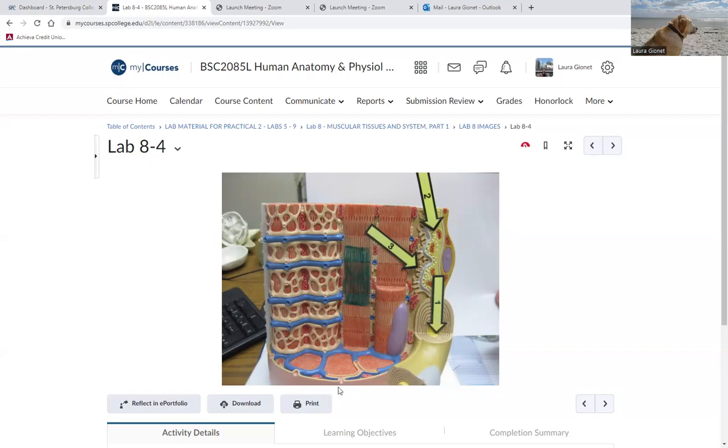Now, if I look to the bottom here, you have kind of a pink membranous region. That is the sarcolemma. The sarcolemma is just a fancy word for the plasma membrane of a muscle cell or fiber, and it's in this medium pink color here. It surrounds the whole thing, but that's where we see it down here. While we're here, I'm just going to point to it all.